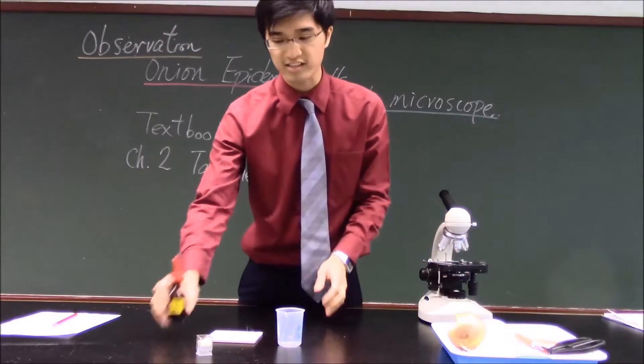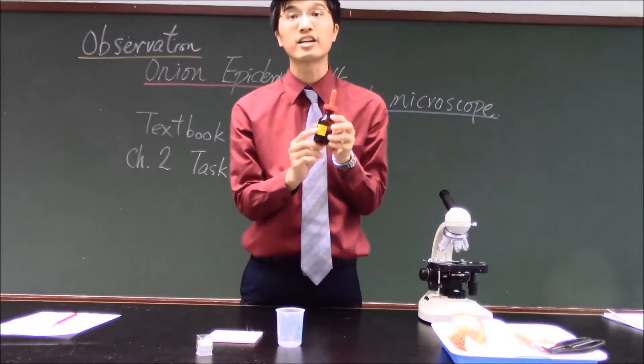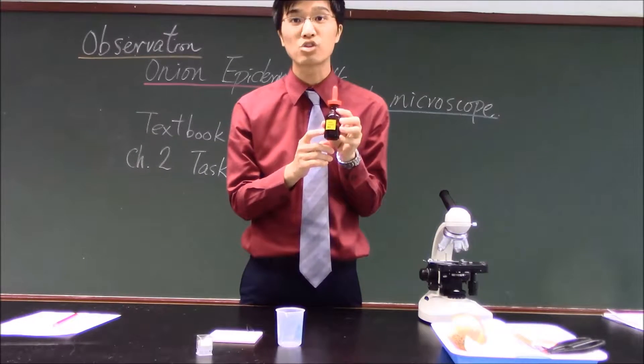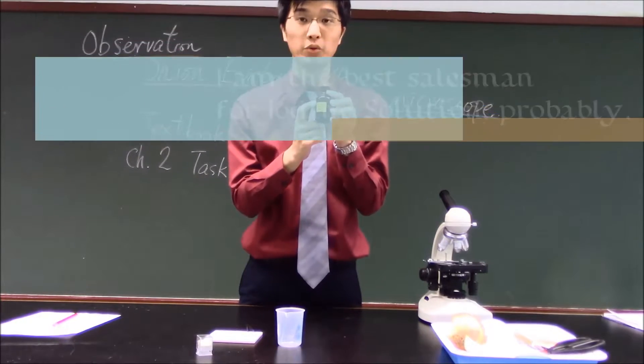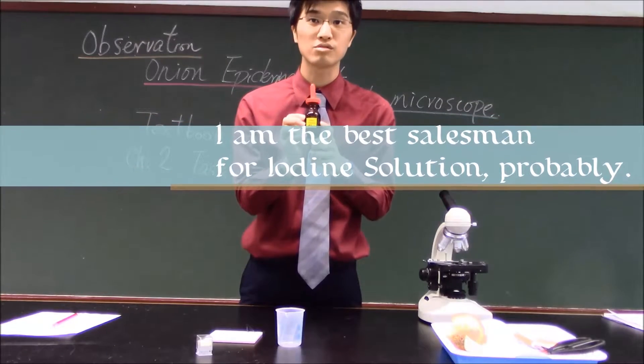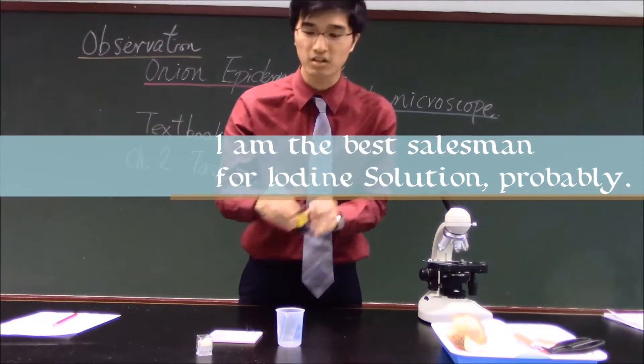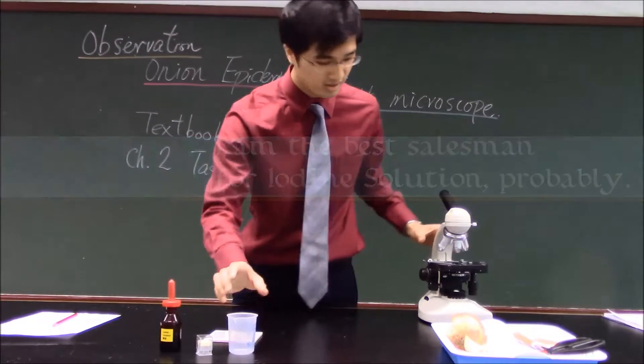And the other thing is that, you know, the onion, the color is quite pale, so you need to add some color to make it visible. So we have the iodine solution. We have to add some on the onion cells.